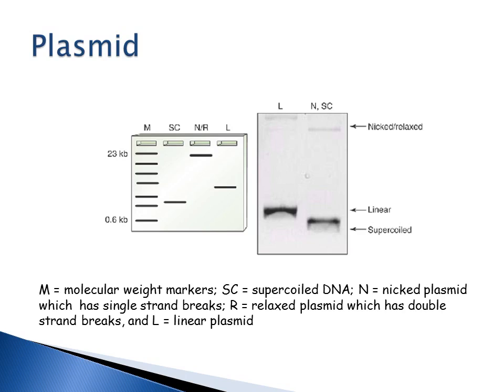using an extraction kit. And then you can also run your plasmid DNA on an agarose gel just like you would DNA or RNA. You're also going to use a molecular weight marker so that you know the size of your plasmid. The thing about plasmids is they are supercoiled, so they will run very far on a gel. But plasmids commonly get nicked up.